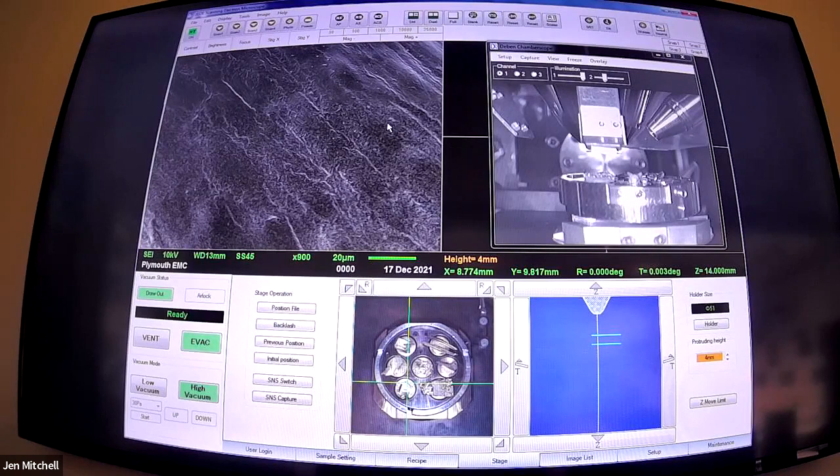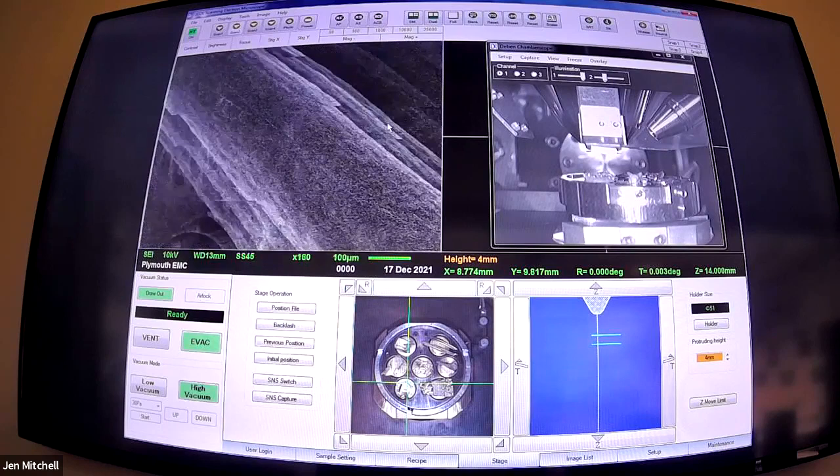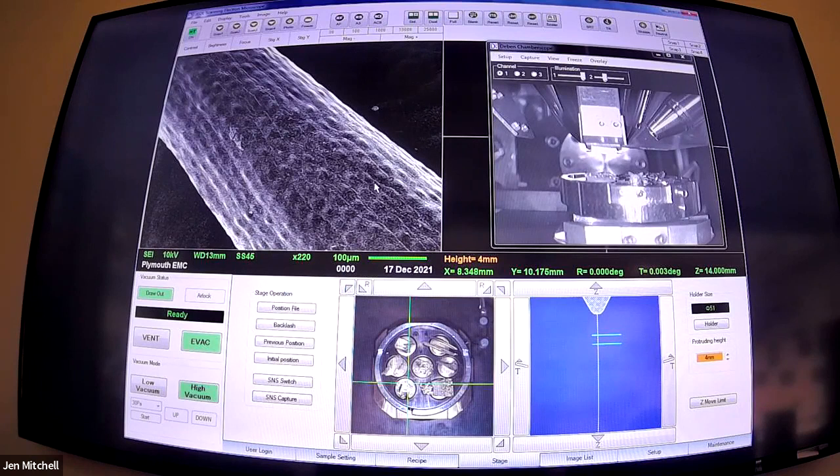They're a lot smoother on the top here than you see on the other side of the leaf. It's quite bumpy actually - you can get some bumps. It's got a little mogul field or something. So that's Holly - you can feel a bit better if you get caught on it in the next few weeks because it's just legitimately very pointy. Designed for mischief and mayhem.